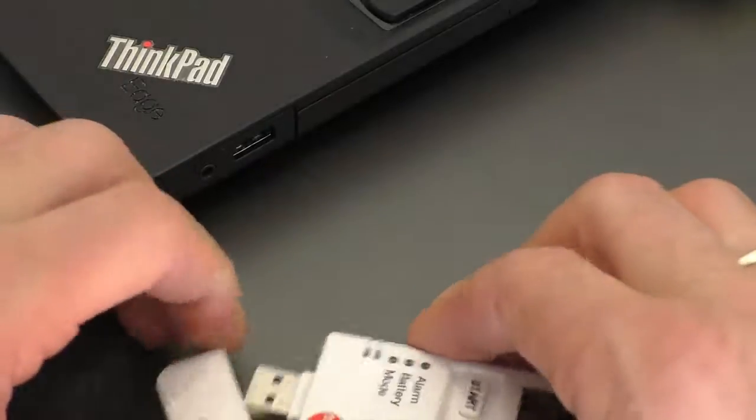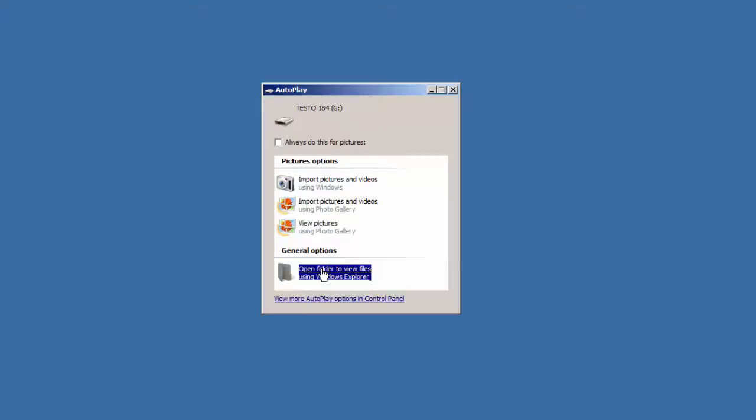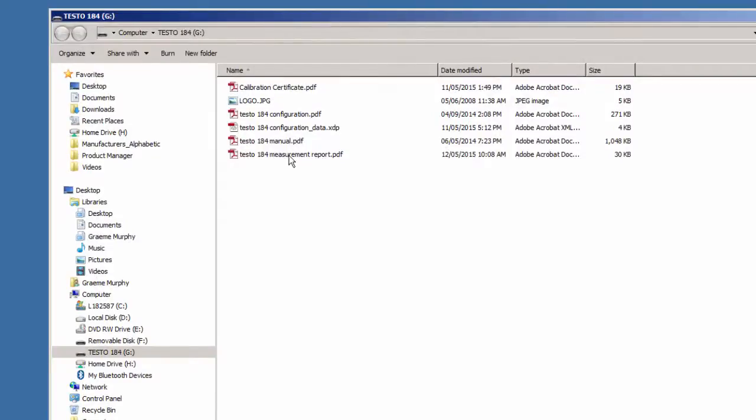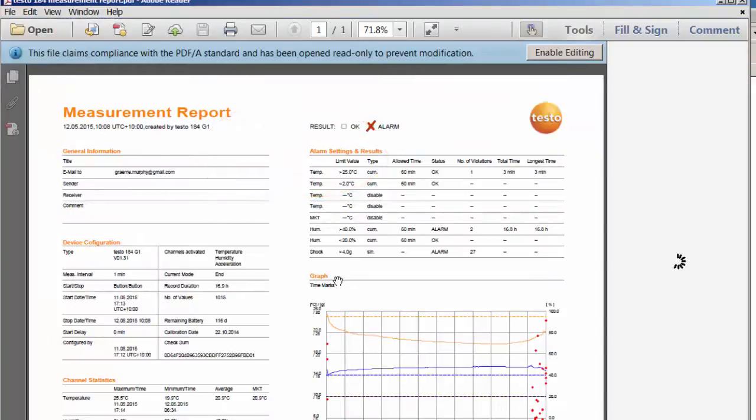So I'm going to open the device and plug it back into our PC. We've inserted the logger and this window pops up again, so I'm going to open and view the particular folder. You'll notice we've now got a report. I can double click to open that report and here's all the data — wonderful. We've got a graph, the whole lot. Everything's on that PDF report, and it cannot be modified. The alarm event is tagged in there.